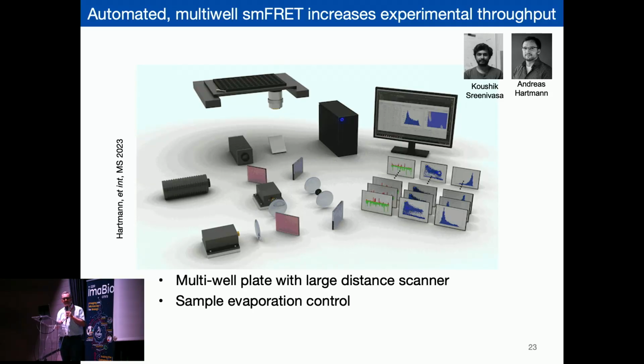The trick is published. It's very, very simple. You do the PCR trick. You heat the surface a little bit more than your solution. So we put here a pad that is sold on Amazon for aquariums where you can heat. It's 10 euros. You put it on top and you put it 1 Kelvin warmer than the room temperature, and you don't get condensation on the top. And you can seal it up with a parafilm beforehand, and then everything is fine. But it took Kushik a few trials to figure that simple solution out.